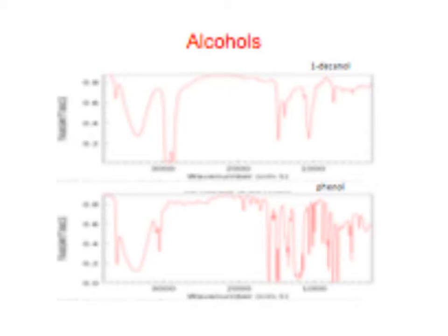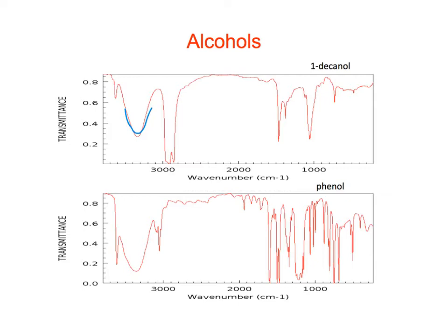Okay, in the alcohols, this is one of the easiest ones to tell as well, as here's the OH stretch. Okay, and I was just crossing this out before, but I was just reading today. This is usually the hydrogen bonded OH, and this is kind of the free OH.